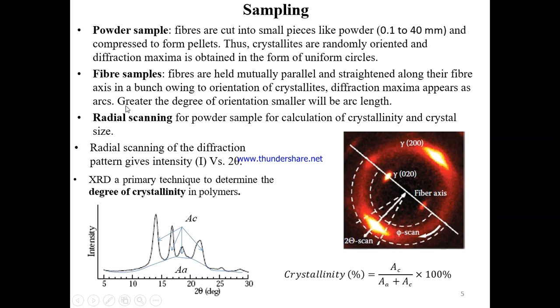Here, in the case of a fiber sample, a typical sample holder is available where you need to wrap the filament or fiber, or place the fibers parallelly on the sample holder. Either you wrap the fibers or filaments on the sample holder by placing them parallelly. Here no cutting is required, so the molecular orientation of the fiber is not disturbed.